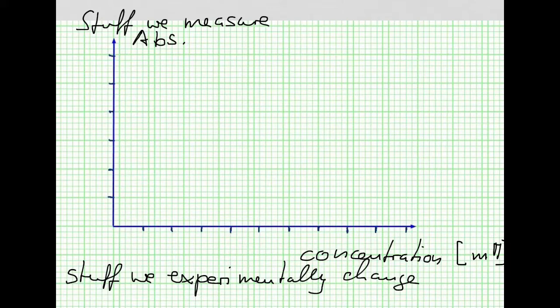What is the unit for absorbance? Sorry? There is no unit. Okay. Absorbance. What you can do actually to show that you understand it, you just say no unit. Yeah? That indicates it's not just because you forgot it. It is actually, you know that there is no unit.